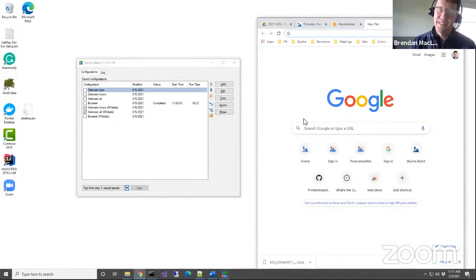Yeah, it's Skyline, and all the things that Skyline can do are somewhat nonlinear. It's not a completely "here is a set of steps and you get a specific output" kind of tool. We still are trying to enable a lot of different things that people might be doing with these data. So the tutorials are definitely a great place to go.